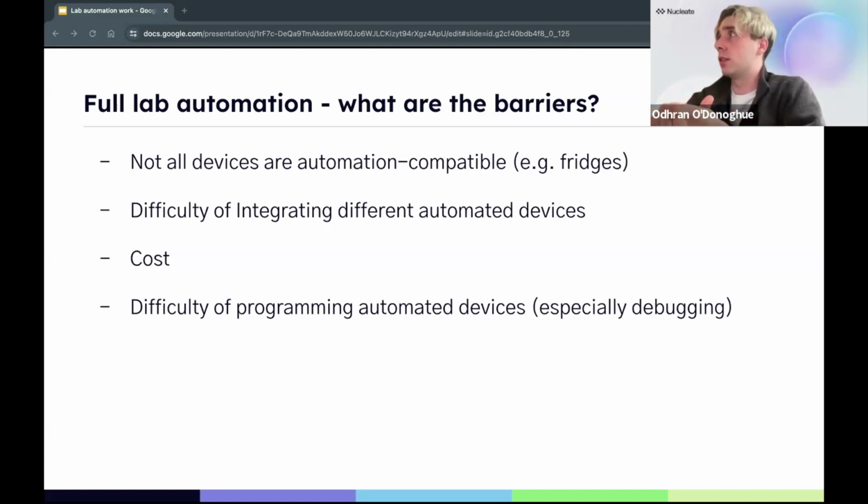On top of that, there isn't really centralized provision in science. All our different devices come from very different people. Some can be very niche. And even if devices are designed to be automated, there isn't immediately a way of integrating them together. It's not like a car where all the parts slotted together perfectly. This is a lab. The devices are fluid. You don't have that ability to just glue things together and have them magically work like Lego.